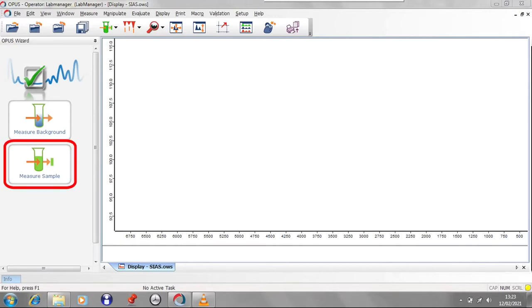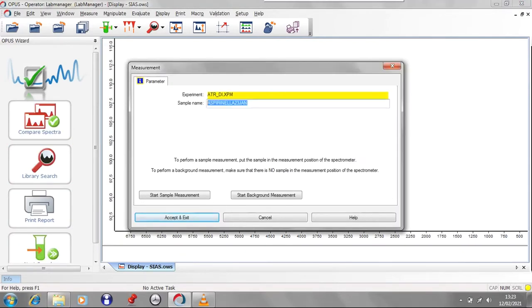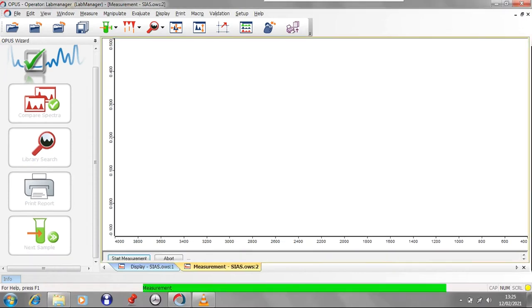Click on Measure Sample. Don't alter the experiment name but set the sample name to your own choice. Then press Start Sample Measurement. The window will close and the spectrum window will open. This is showing you your spectrum but isn't saving the data yet. Press Start Measurement in the bottom left-hand side of the spectrum window to begin recording the spectrum.